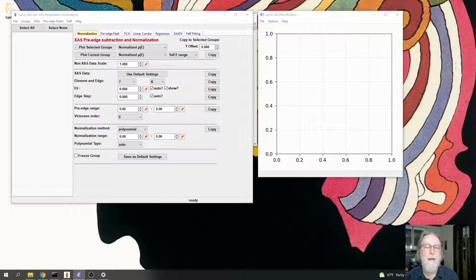But it will also depend on these non-trivial electron scattering factors that will depend on the species of the absorbing atom and on the scattering atom. While this gives XAFS some sensitivity to Z of the scattering atom, it also means that we need to get those scattering factors somehow. And at this point in time, using Feff is the simplest and easiest way to get those factors.